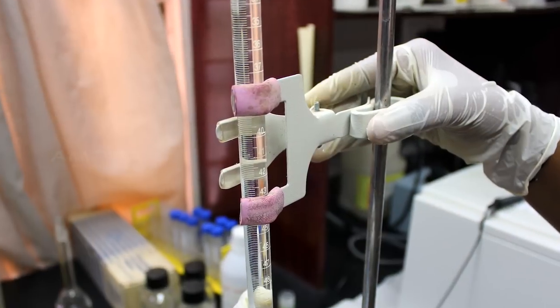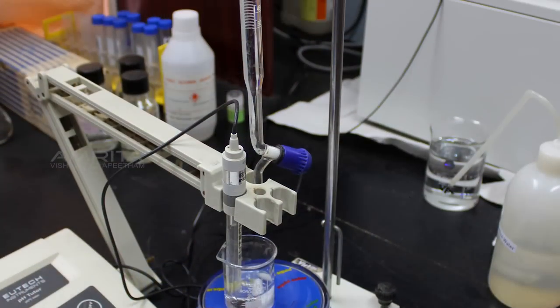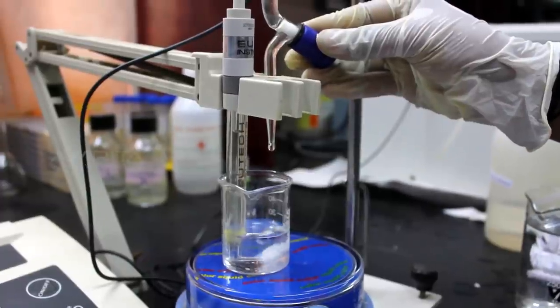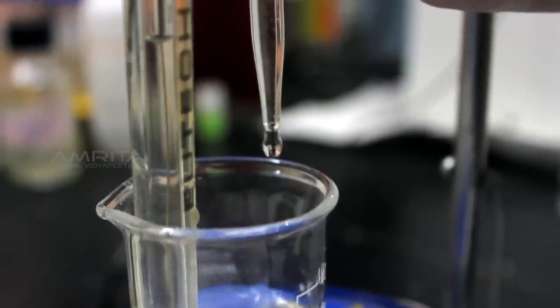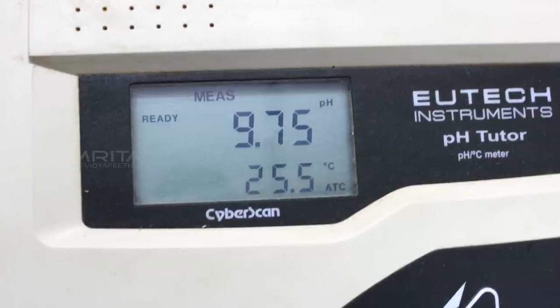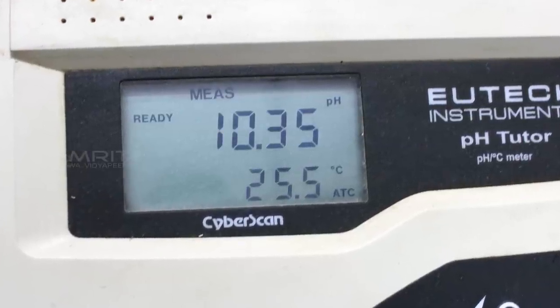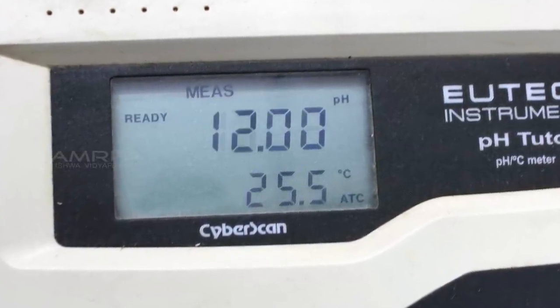Now clamp the buret containing 0.1 molar NaOH to the stand and slowly add aliquots of 0.3 ml NaOH into the beaker containing 0.1 molar glycine. Note down the pH reading after each addition of NaOH till the pH reaches above 12.